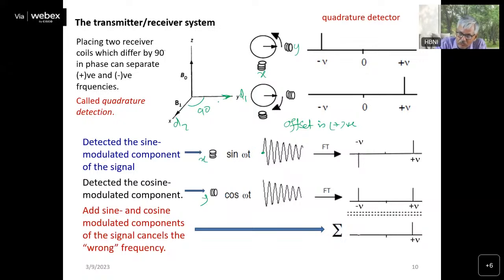Now as it is moving this way, slightly the signal will increase in this detector, and you can see now it is increasing. As it rotates, there will be a harmonic oscillation, a regular feature.